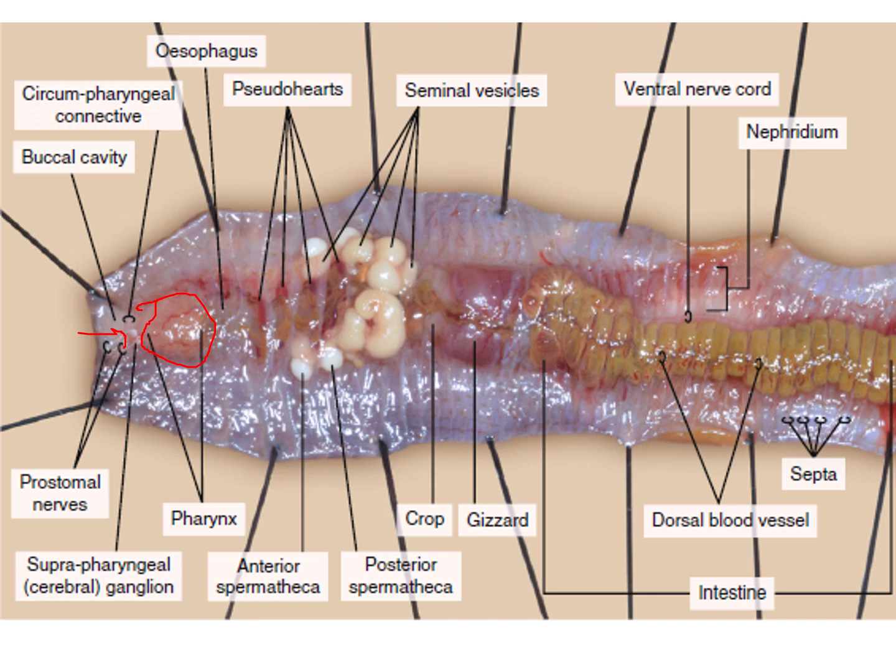intestine, and this intestine may be called the midgut, and it is straight and thin, that helps in digestion and absorption. We can see the intestine is yellow in color because yellowish brown chloragogen cells are present on the intestine, and they give the intestine its yellow color.